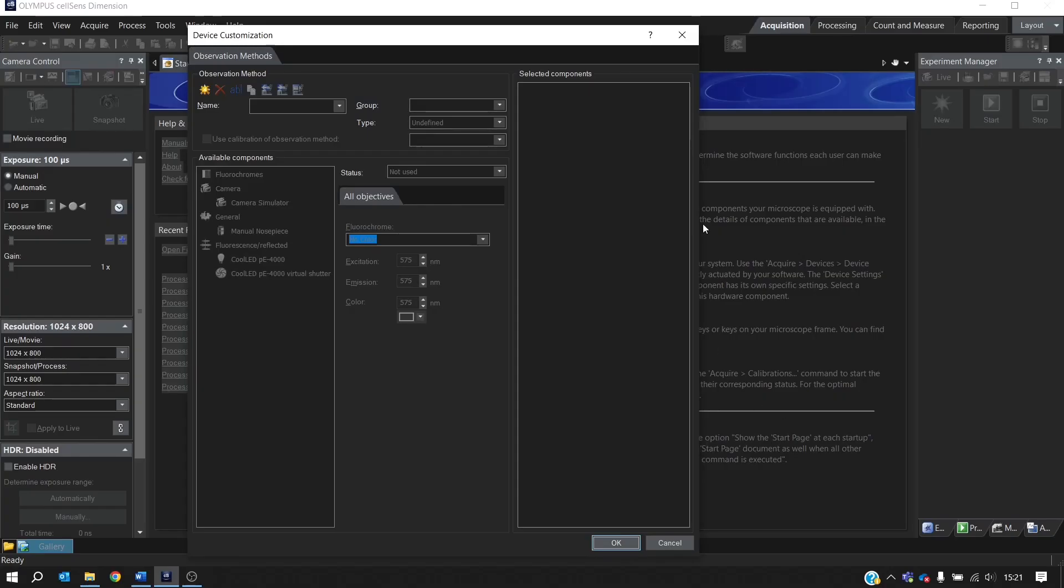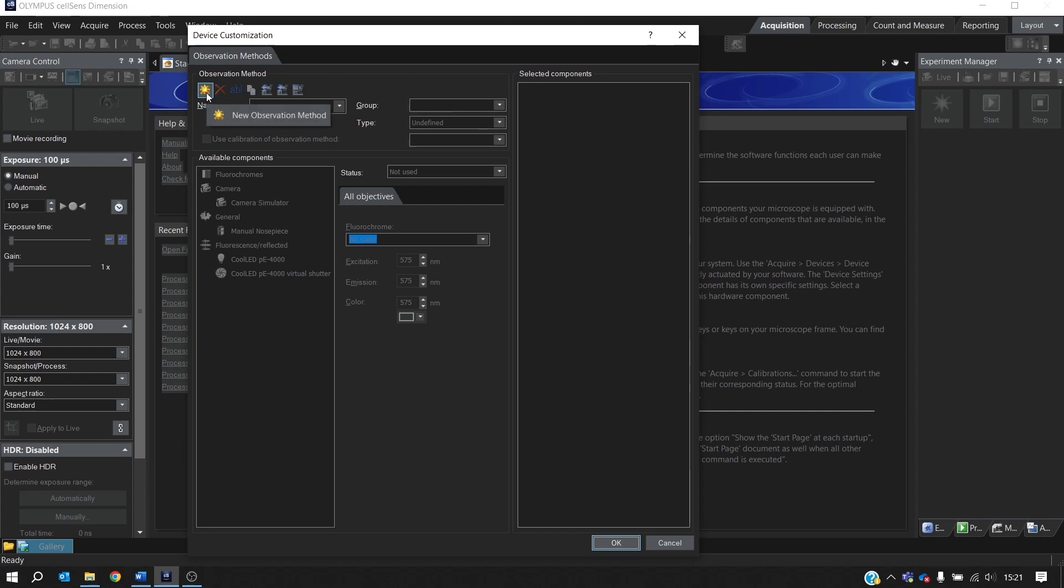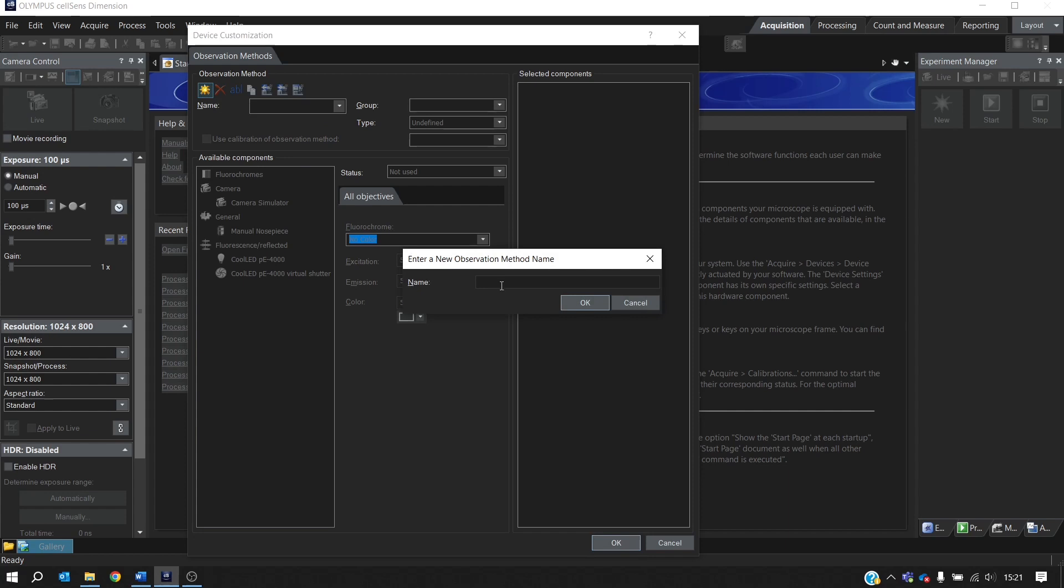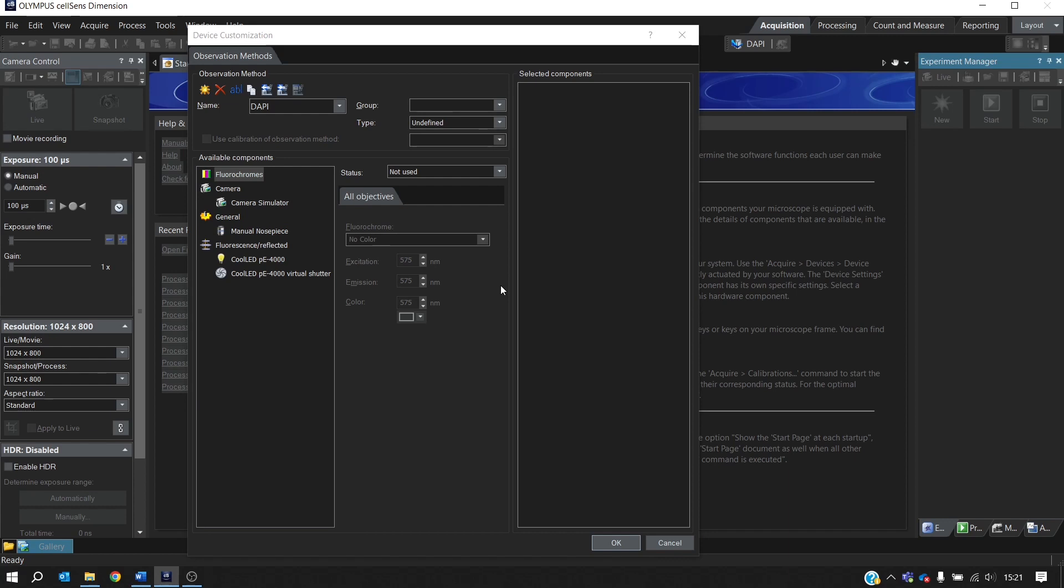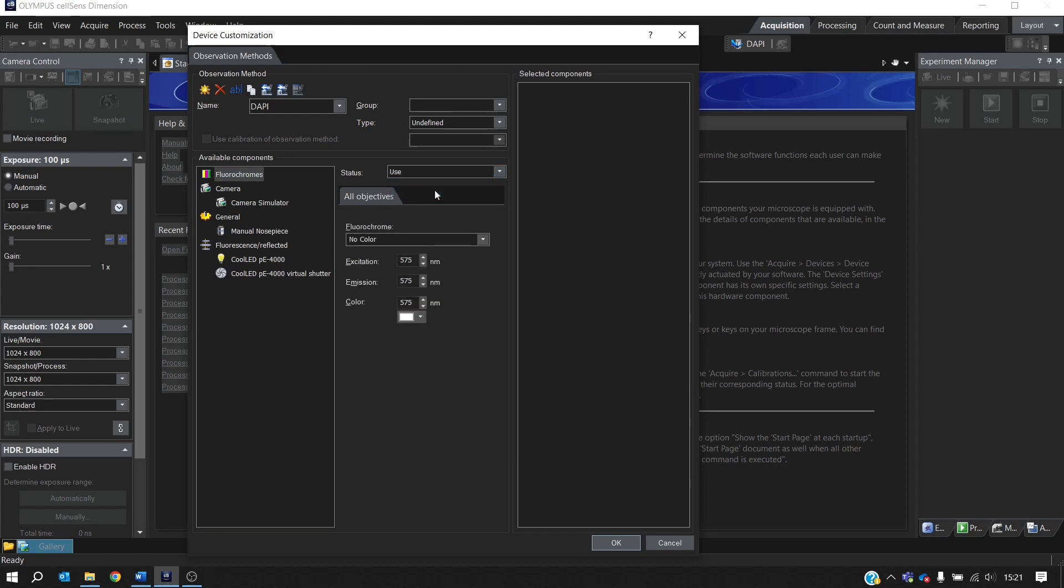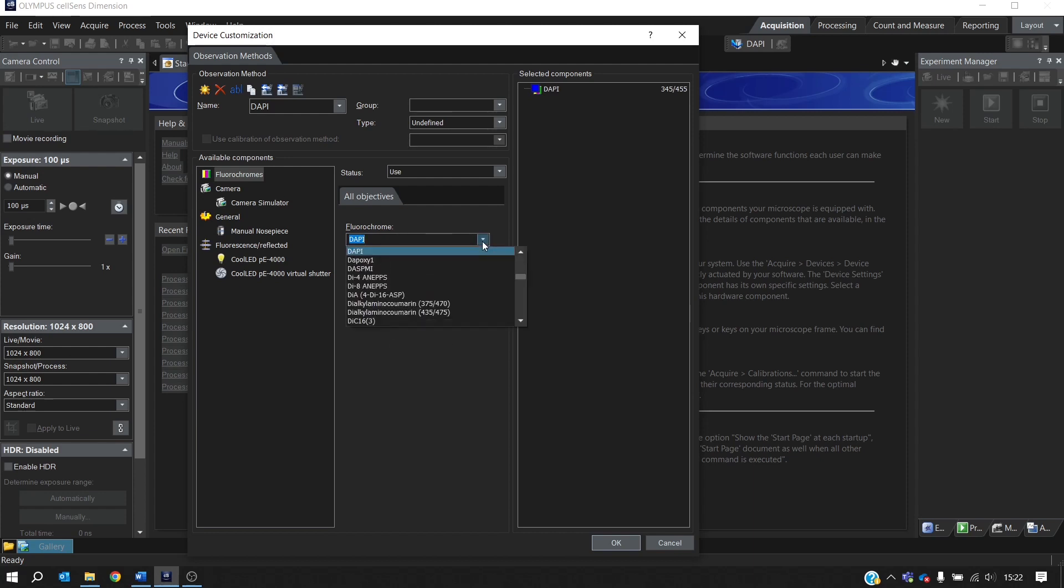This is where we can set up observation methods with customized LED settings. In this example, we're going to use DAPI and FITC. And we start by creating two new observation methods by selecting this icon here. We'll call this DAPI. Press Enter. And then we need to assign the fluorochrome. So select Fluorochromes here. And from the Status drop-down, change Not Used to Use. Then we can simply type in DAPI and press Enter, and it has assigned the fluorochrome here. Or we can select it from the drop-down menu.